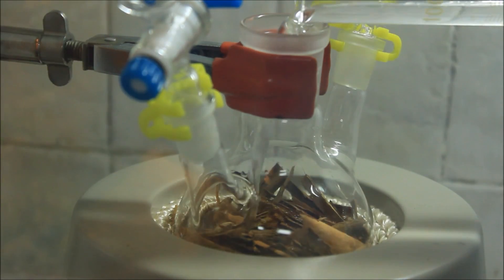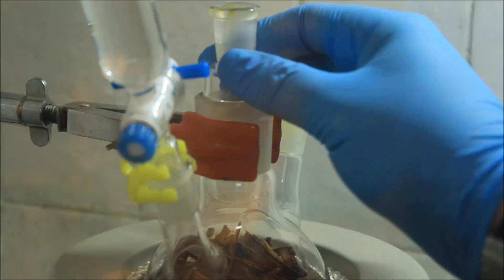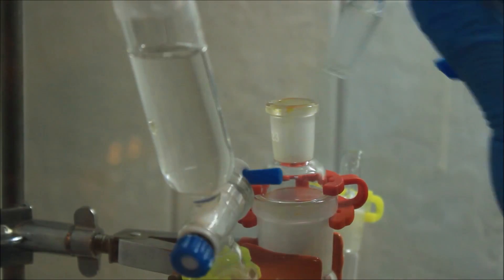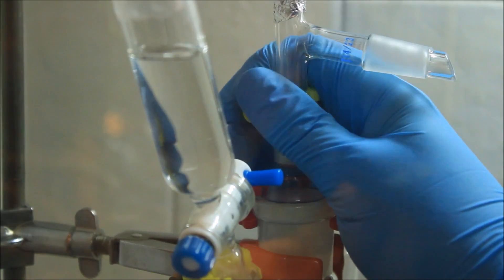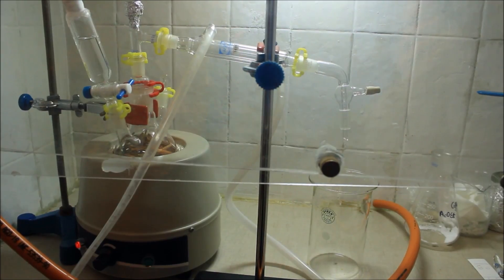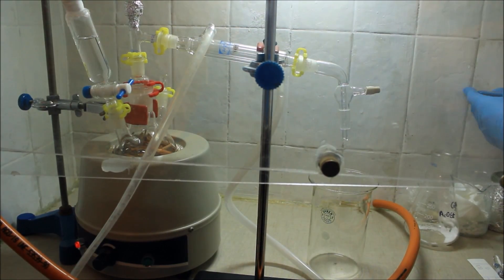Then, an addition funnel is placed in one of the necks of the RB flask. The other neck is blocked using a glass cork. Then, a general distillation setup is assembled. The water flow and the heating mantle are then turned on.